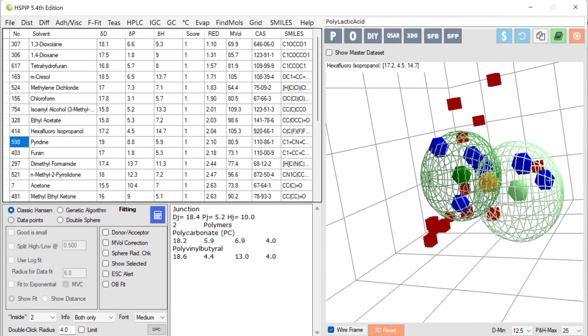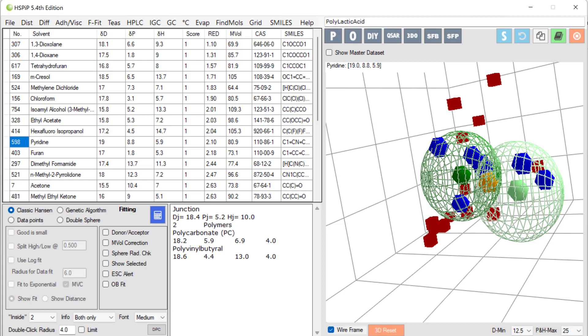Of course I could use hexafluoroisopropanol for this polymer. Or I could use pyridine for this polymer. But they would each be good only for that polymer. It's the junction at 18.4 or 5.2, 10 which would be the best solvent for combining these two polymers.